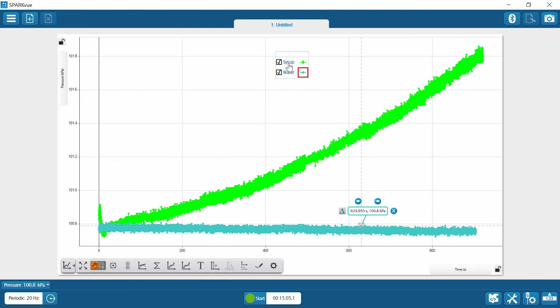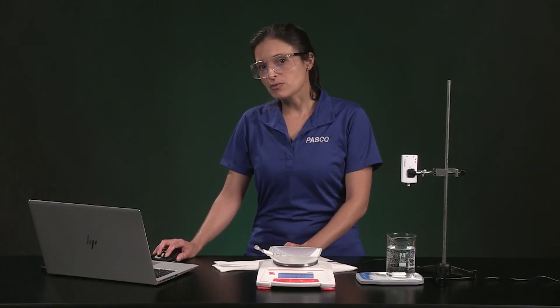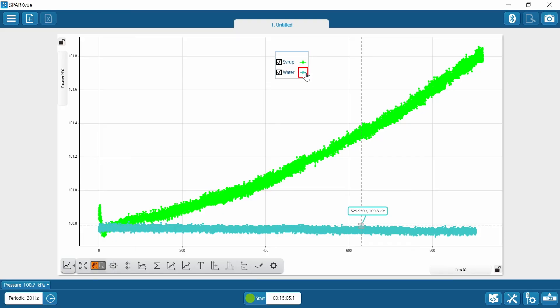Notice how both runs are checked in the legend. I can hide or make a run visible by checking the box in the legend. If I want to get coordinates from the syrup run, I need to make sure the red box is around that run. When you use any of the Spark View tools, make sure the red box is on the run you are interested in. To view both runs at full scale at the same time, make sure both runs are checked and then hit the scale button.